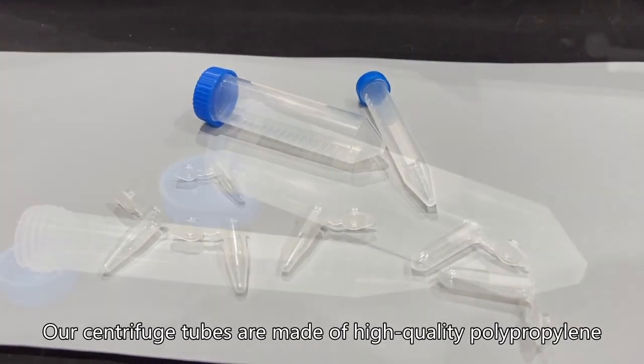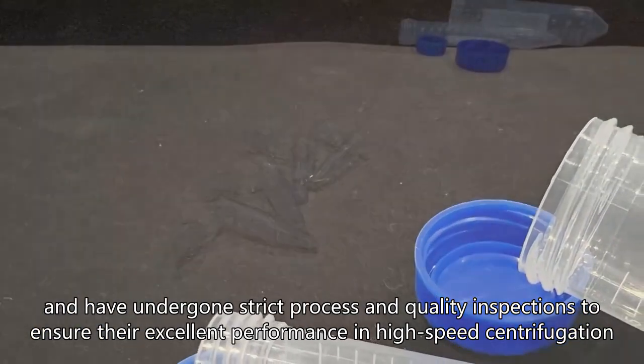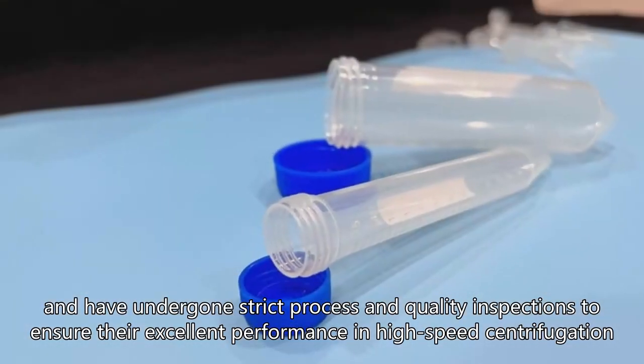Our centrifuge tubes are made of high-quality polypropylene, and have undergone strict process and quality inspections to ensure their excellent performance in high-speed centrifugation.